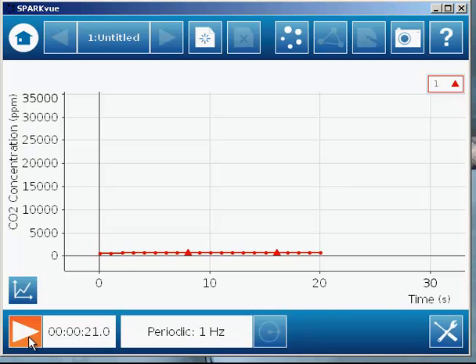Now, if you were conducting a full lab, you would let this run for several minutes so that you had a lot of data to look at. But in the interest of keeping our video short, we're going to stop data collection right now.